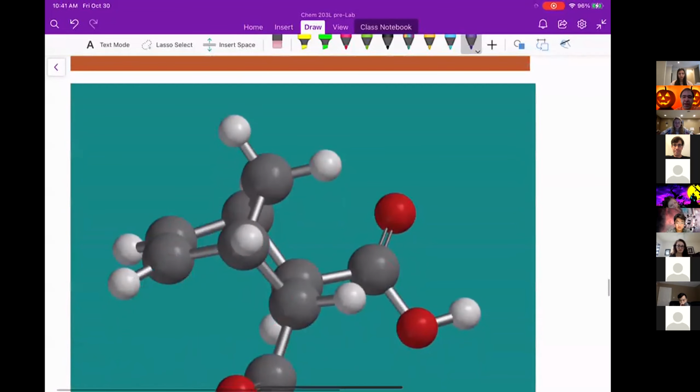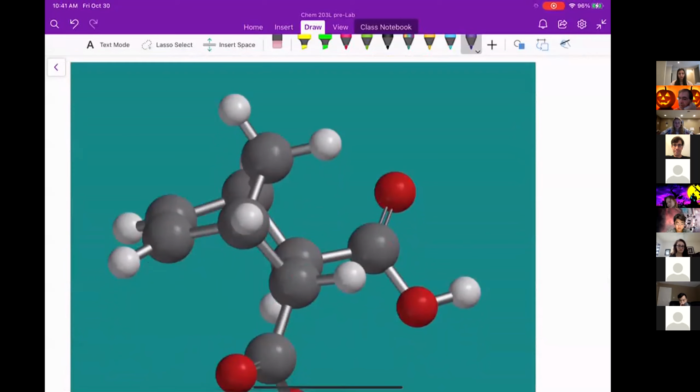But here's what we're talking about, going back to our compound from before, talking about this proton versus this proton. Here was our double bond, right? So we've got electron density above and below the internuclear axis there. And so this is interacting with that. The other side is not. Okay, so if the 3-dimensional arrangement makes your 2 geminal hydrogens be different, then they're probably going to appear as different peaks. If they're in the same 3-dimensional arrangement, then they'll appear just as a single peak.